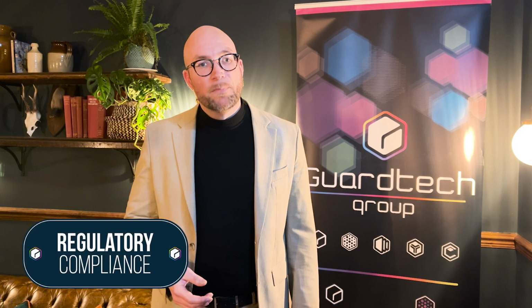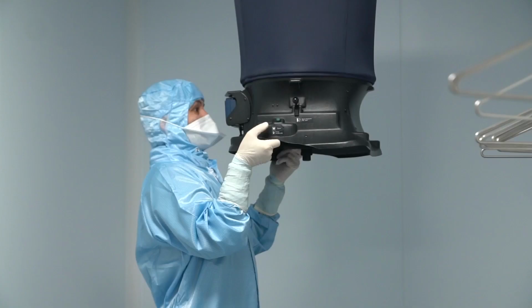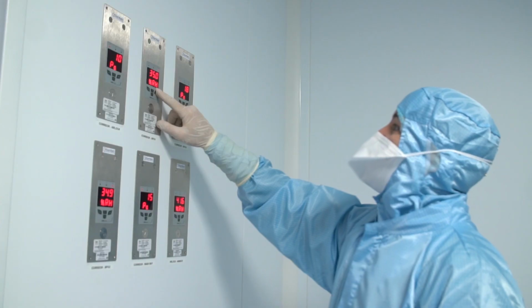Regulatory compliance. Is your product regulated by a governing body such as the MHRA, the FDA, World Health Organization or NADCAP? And if so, what guidance do you need to review, understand, consider or follow?